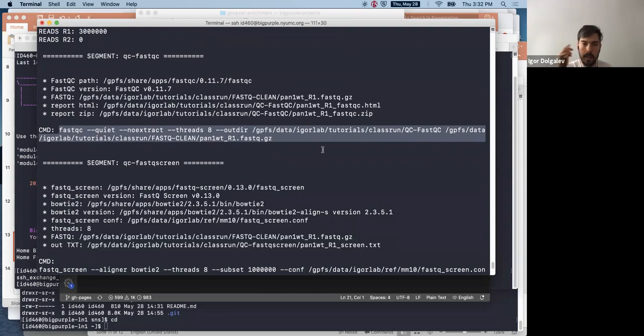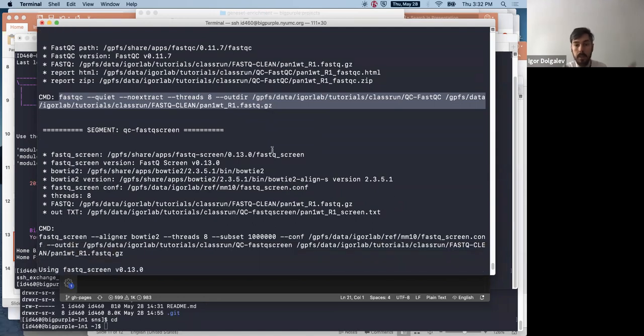And I think you guys have done this in some of the earlier classes, which is writing a bash file where you can have different parameters, and then you can run the tool in a more automated way. And then you might want to check if your inputs and outputs are valid. And then maybe you want to do multiple samples at the same time. And so basically that's how you end up with SNS at the end, just over time, slowly adding more and more automation features. But at the end, you really are just running a series of commands, one after another.